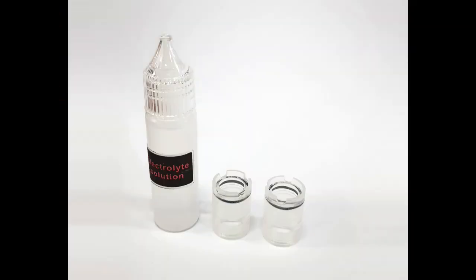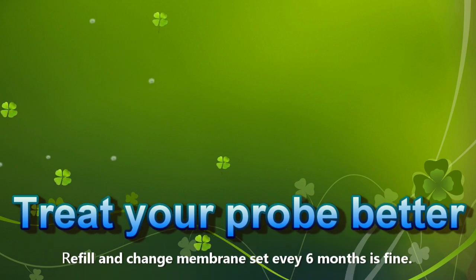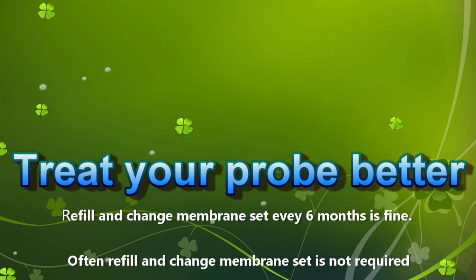This product comes with 2 spare membrane sets, enough for 1 year of use. Generally speaking, it is enough to add liquid and replace the membrane set once every 6 months.